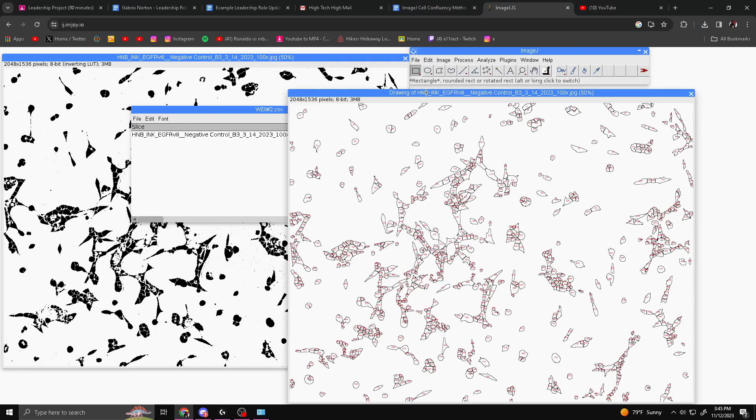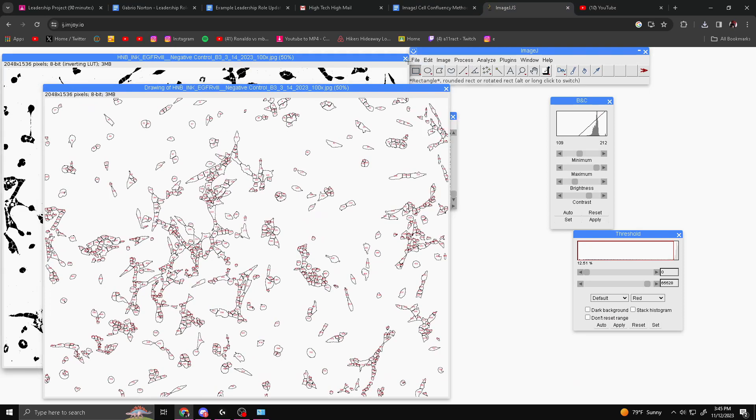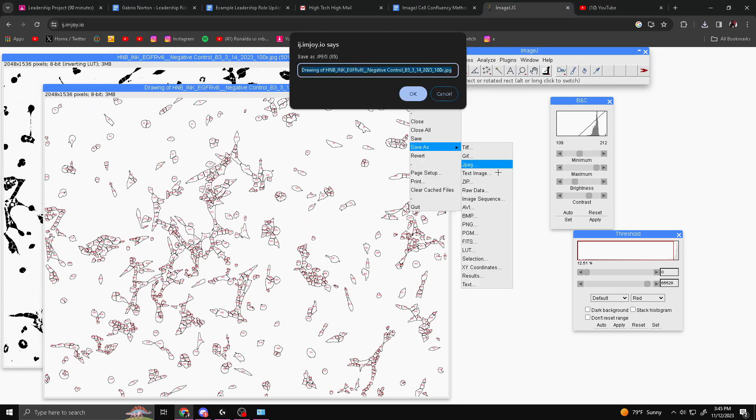You also want to save the drawing, which is this thing right here. You want to go to File, Save As, JPEG. Then it will basically by default show you the name of the file that you took, and then you just want to hit OK.